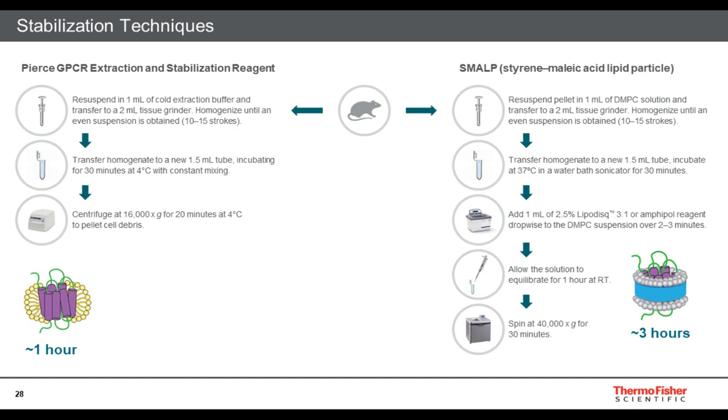A new and promising tool in membrane research is the detergent-free solubilization of membrane proteins by styrene maleic acid copolymers, or SMAs. These amphipathic molecules are able to solubilize lipid bilayers in the form of nanodiscs that are bound by the polymer. So membrane proteins can be directly extracted from the cells in a water-soluble form while conserving a patch of native membrane around them.